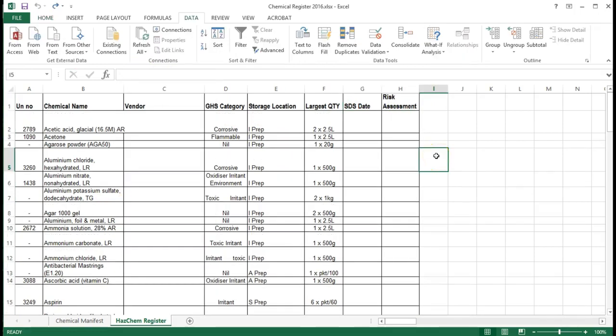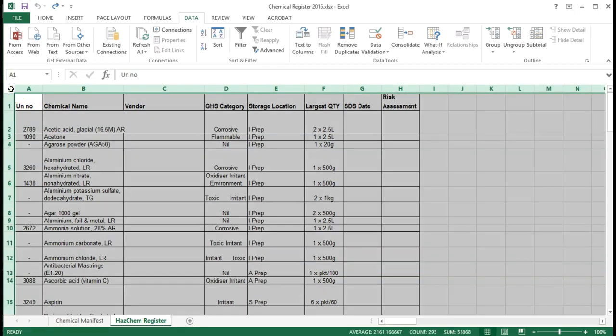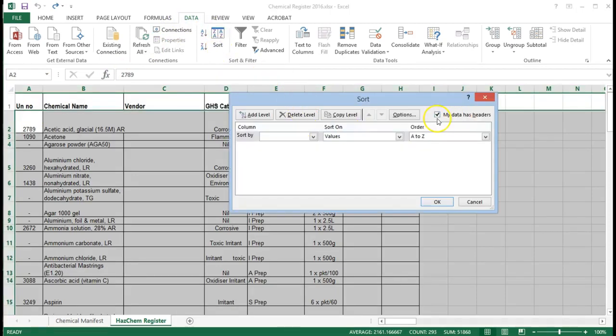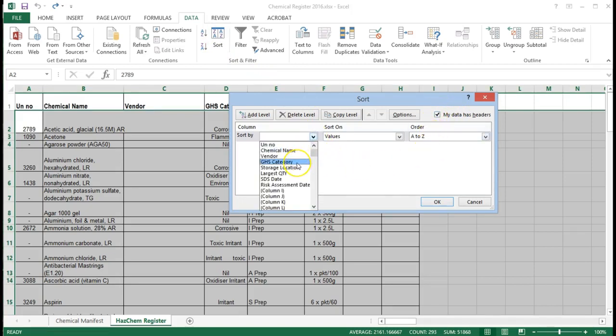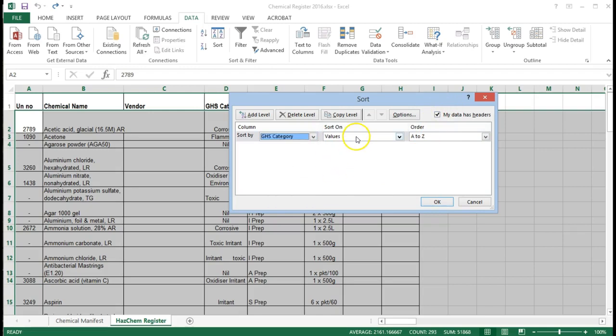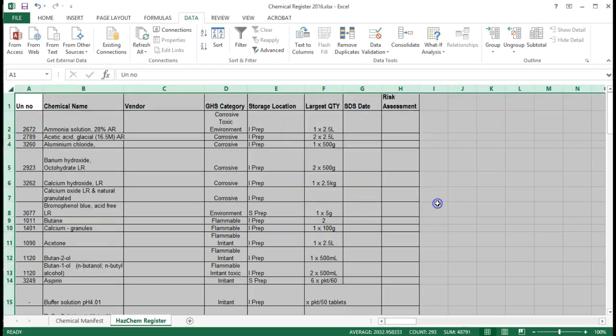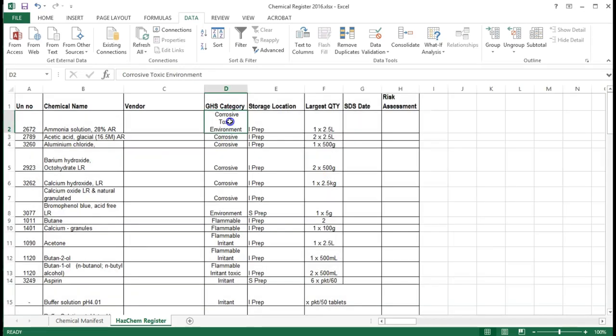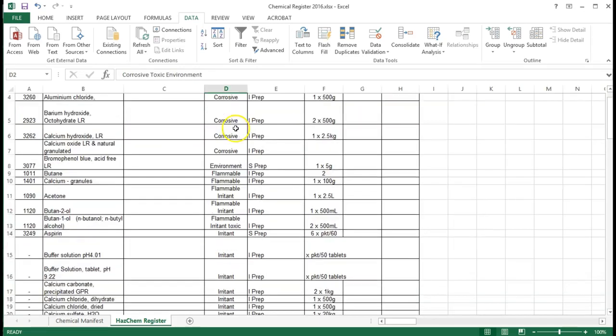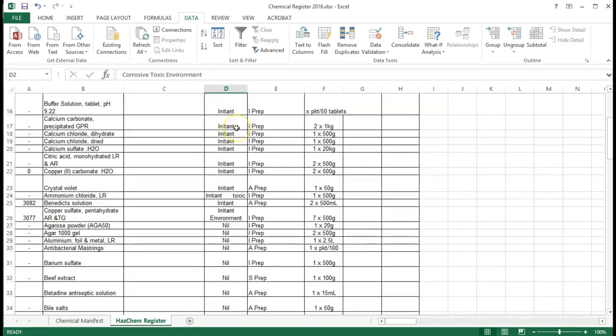Before we add the extra information onto our worksheet, we're going to sort our data on the GHS category. We want to delete those chemicals that aren't classified as hazardous. So we're going to do this the same as in part two. Select the entire worksheet, going to data, sort. You may need to click this, check this box here that says my data has headers, sort by GHS category on values A to Z. So they're now nicely grouped for us.